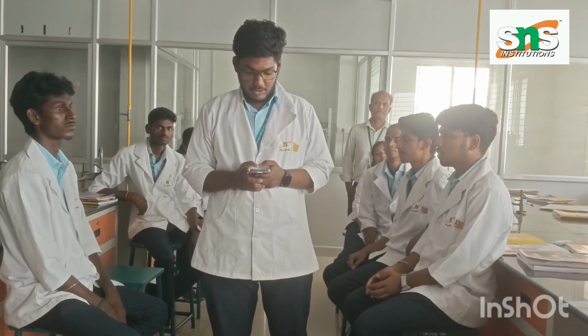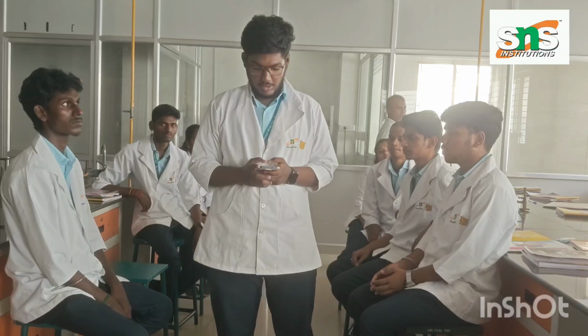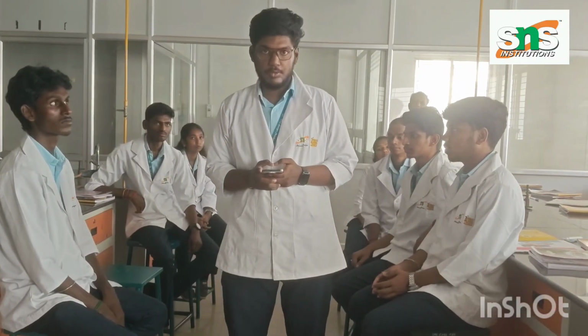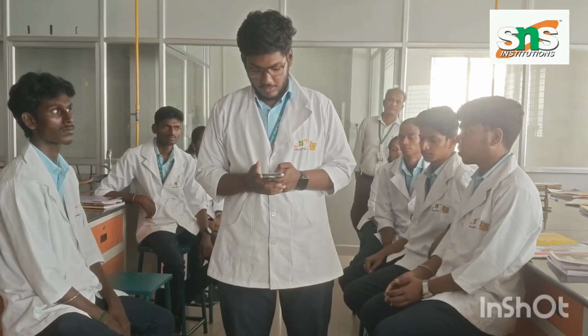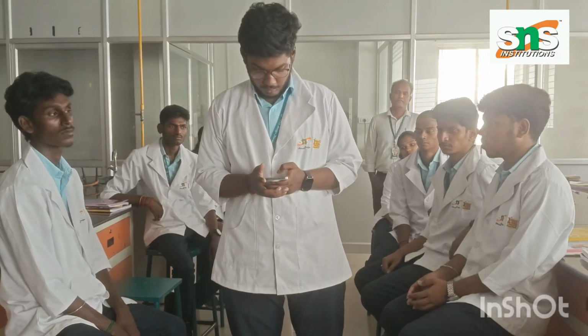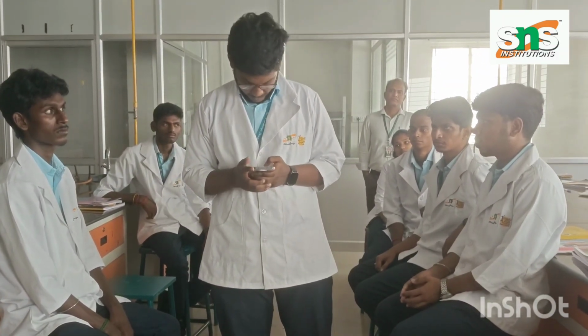Observe how sterility testing is performed in laboratories. Identify difficulties such as contamination risk, complex procedures, or time-consuming steps. Collect feedback through interviews, observation, and discussion. Example: understanding the challenges faced by microbiologists while handling sterile samples.